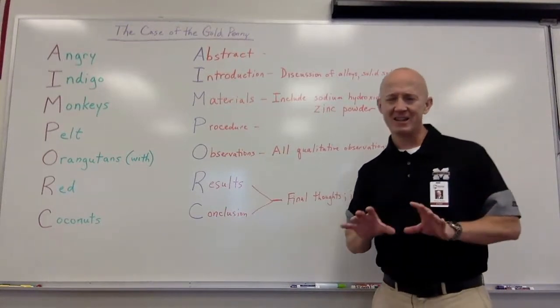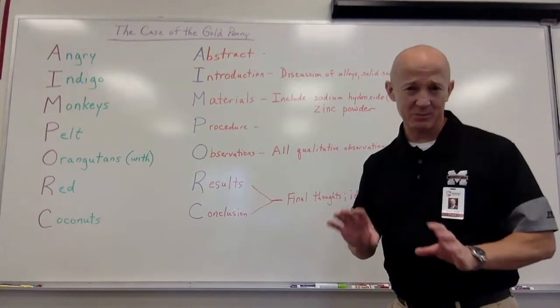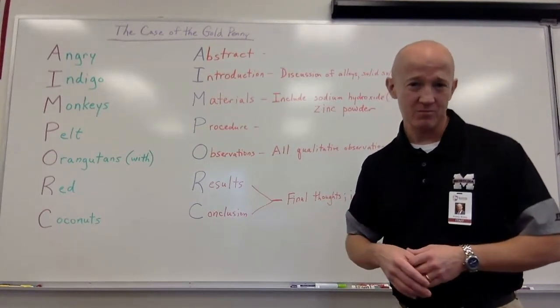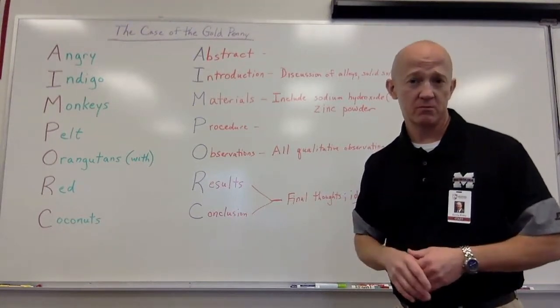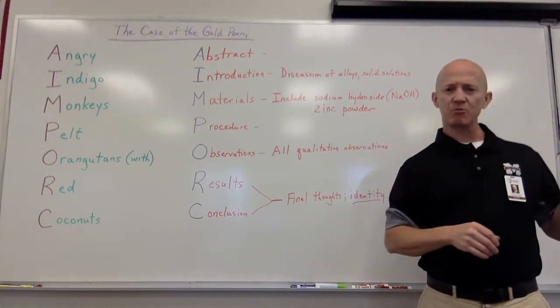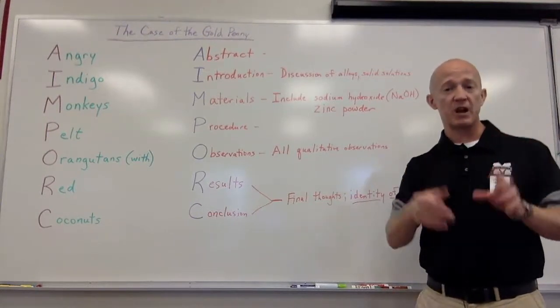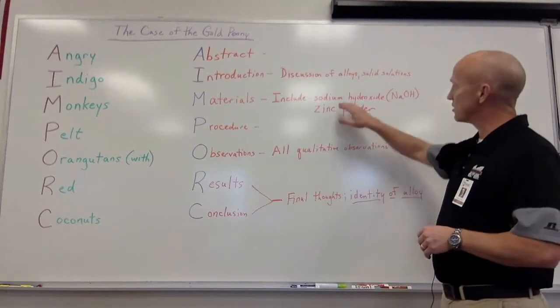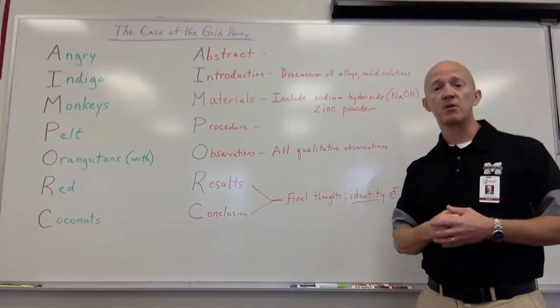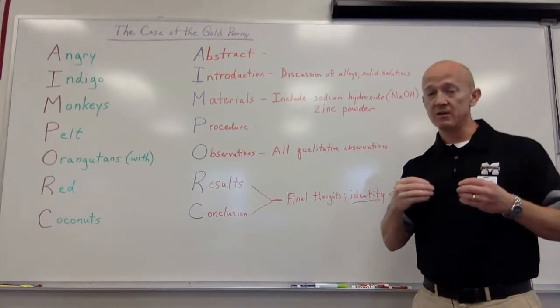Yay! Incidentally, don't go trying to spend this penny. It's no longer really of any use, okay? It's just good for looks. Of the materials, I want to make you aware of two things that are involved here. You'll be able to see the rest during the video, and you can keep track of it as you watch. But sodium hydroxide and zinc powder. These are two of the components we require to make the gold penny.